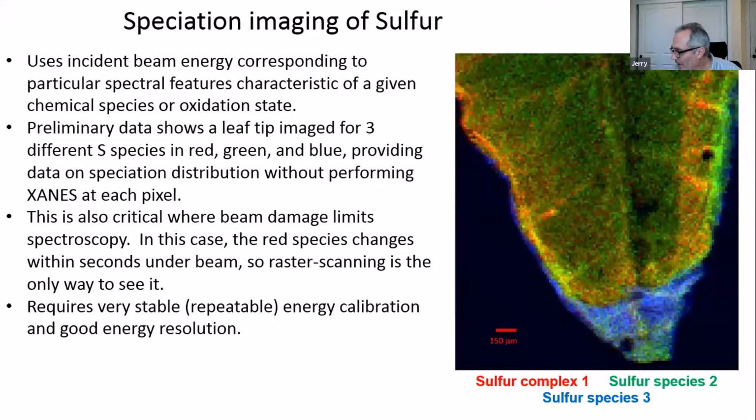Okay, a couple more questions. There was a question about whether you've done or plan to enable doing studies in liquid jets. I've seen a few proposals for that. I think it should work. We have not tried it yet. It's a bit of a challenge inside the helium chamber, but it seems very possible. It's at 1 atmosphere, so yeah, there's a good chance it'll work out.